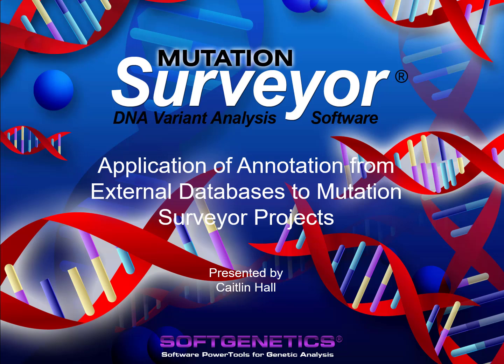Hello and welcome back to another Mutation Surveyor software webinar. Today's focus is on how annotation from external databases can be used when working within a project.